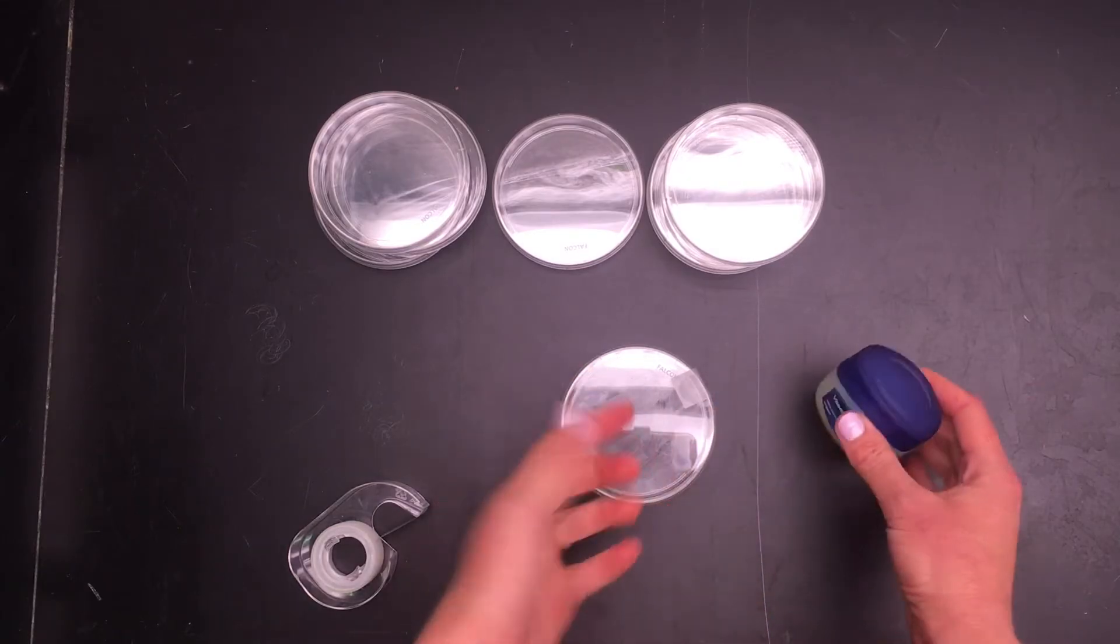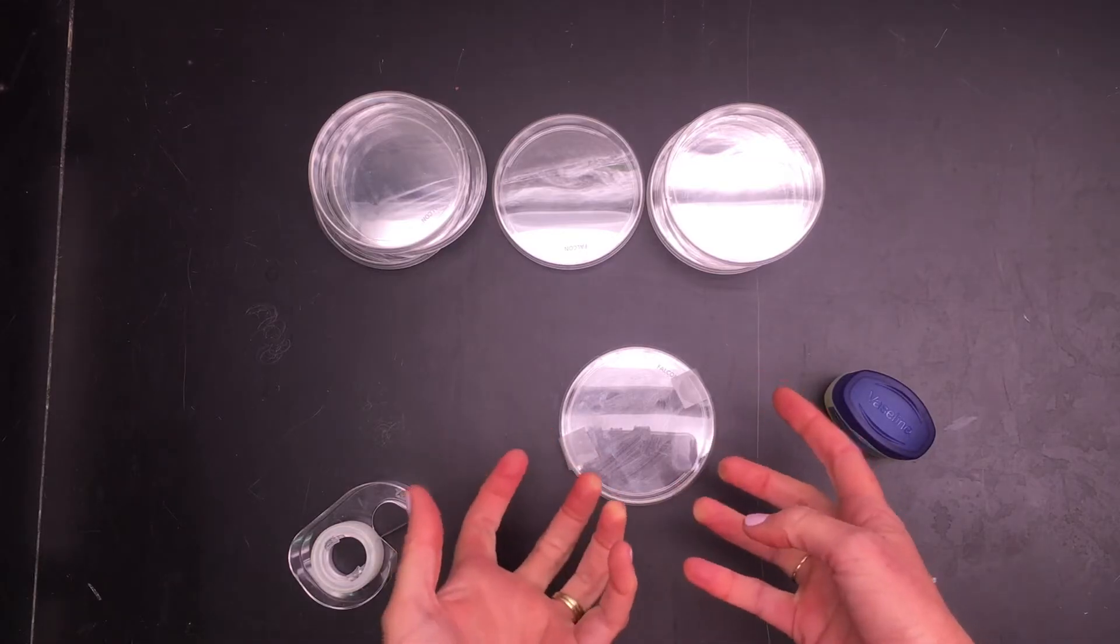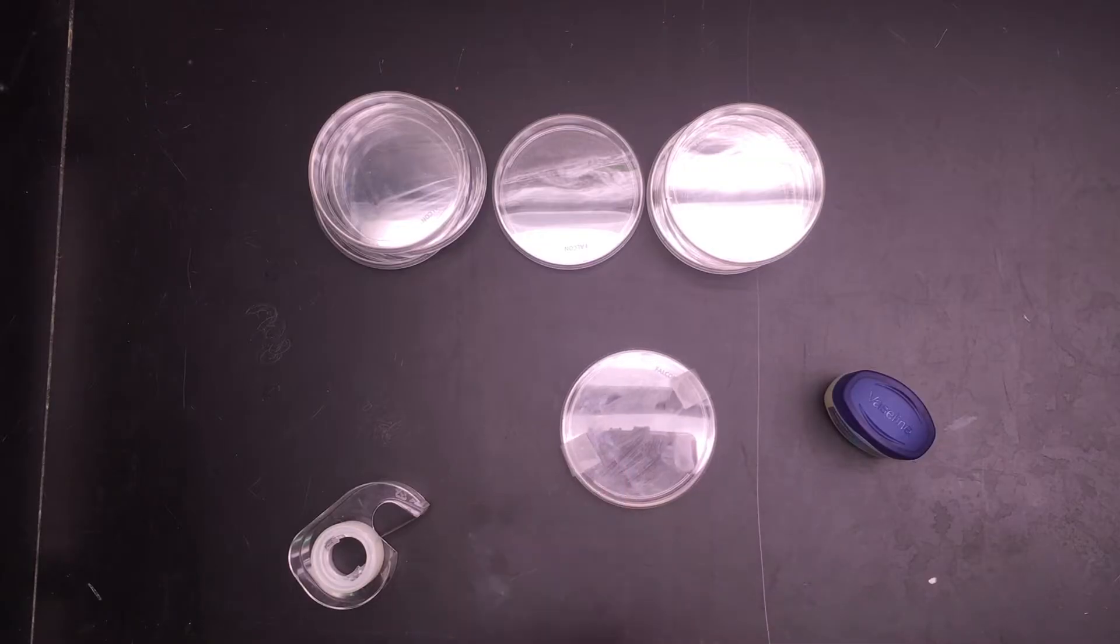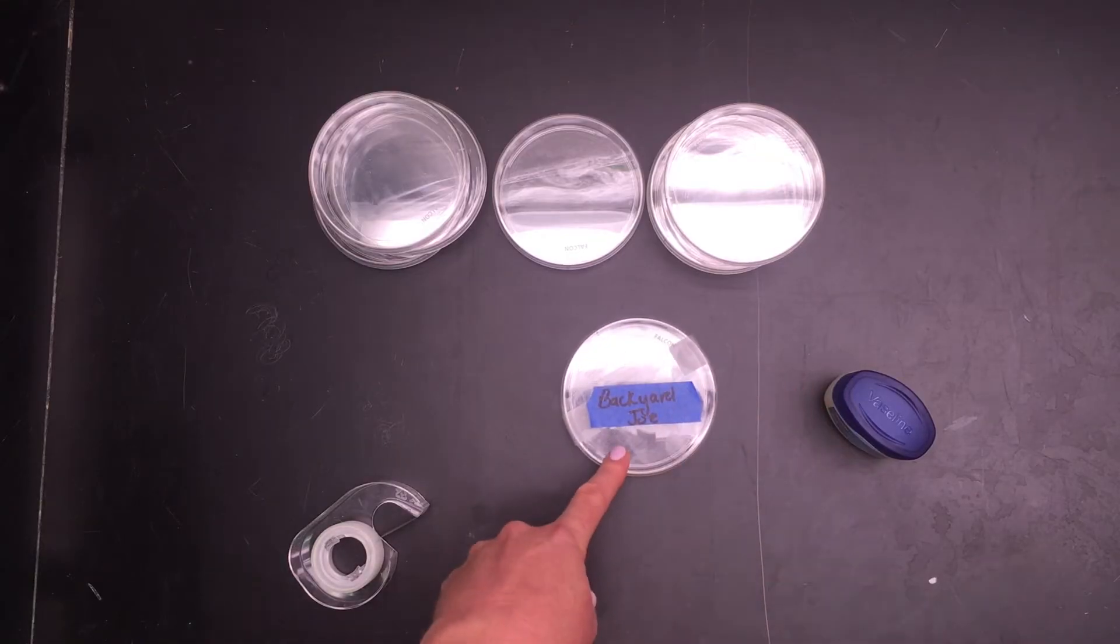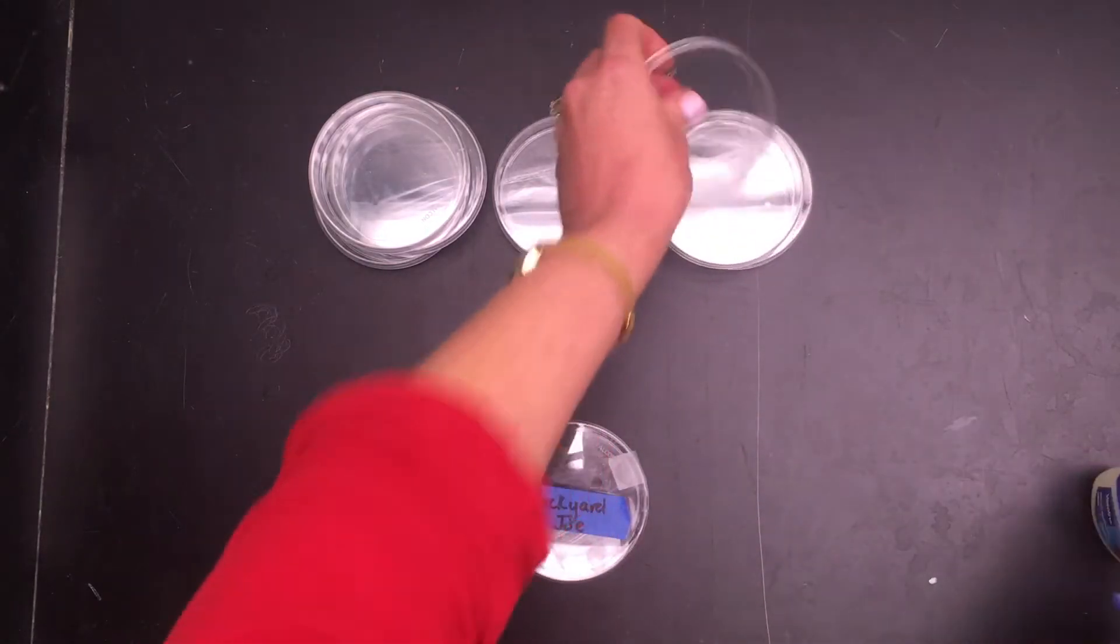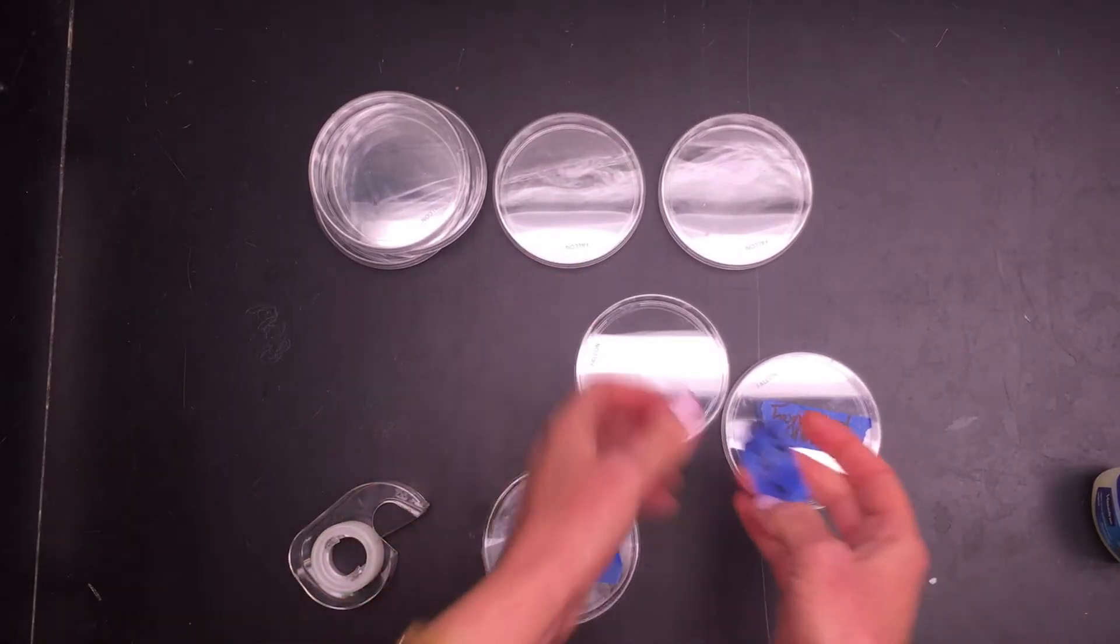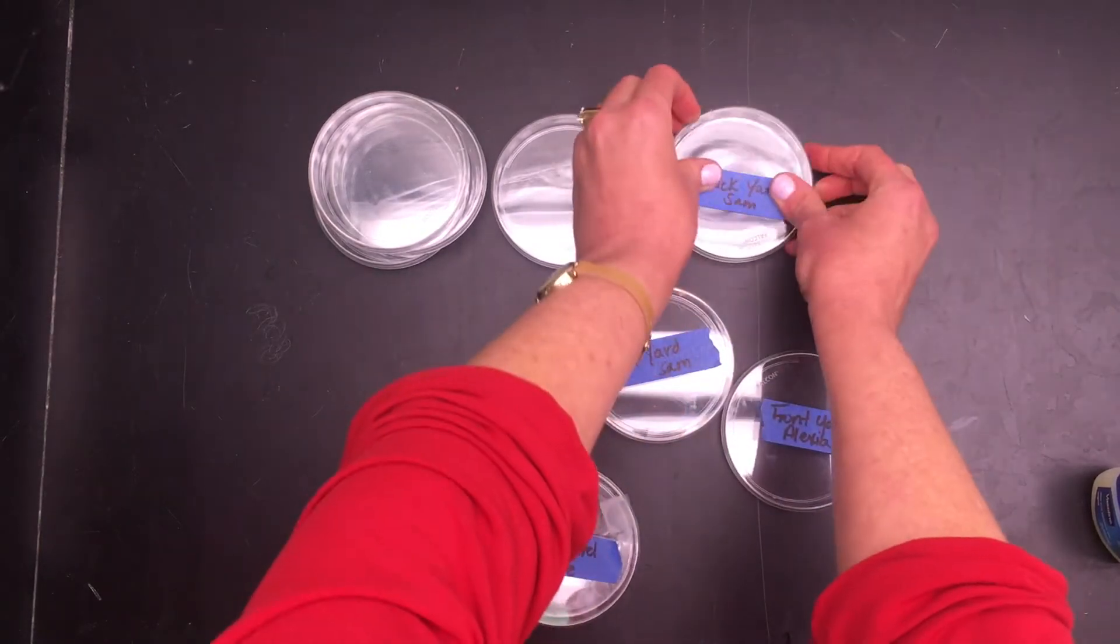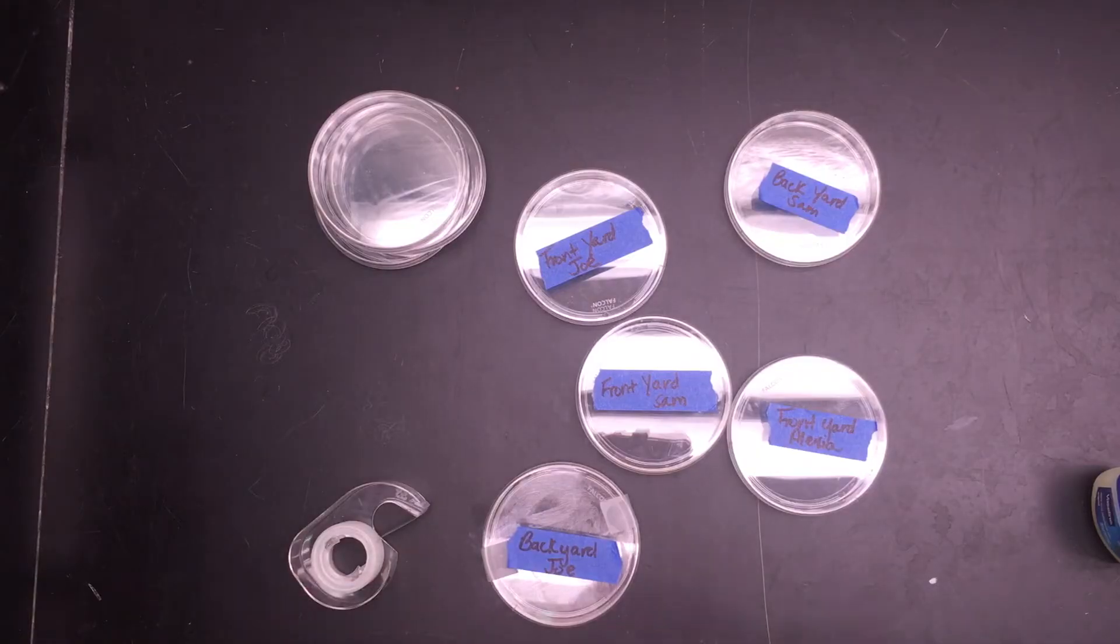If you don't have petroleum jelly, you can even replace it with lip gloss or chapstick or any sort of sticky substance that you would put on with a thin layer. Then you're going to label it—so let's say this one's going to Joe's backyard. You're going to do the same with all of your dishes: smear them with petroleum jelly, put the labels on, and tape them closed.